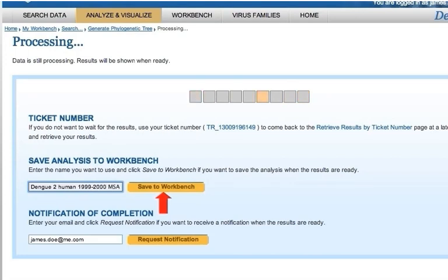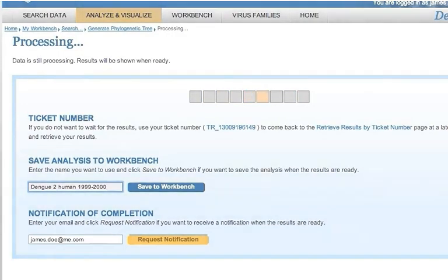After the results are saved to your workbench, you can review them anytime you would like.